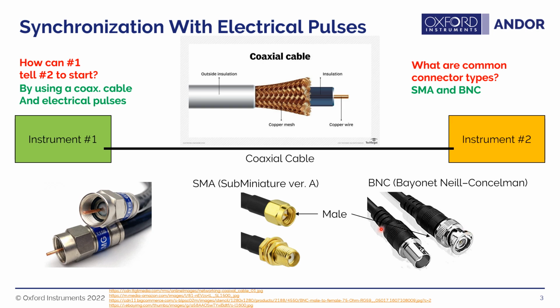And so here you can see what's called the male side because it has a pin coming out of the middle of the cable, and this side is most commonly on the actual cable side, whereas the female connector is most commonly on the instruments themselves.